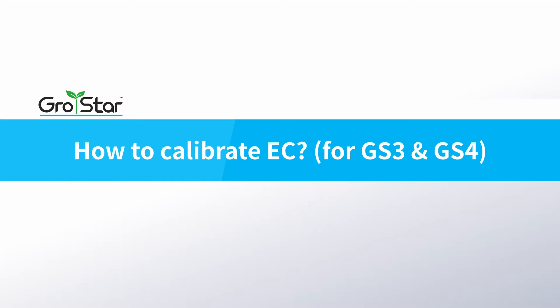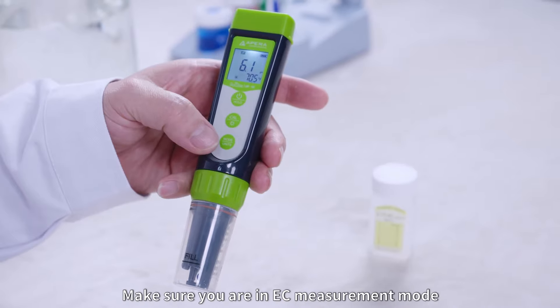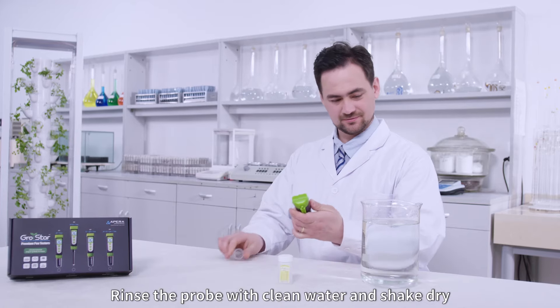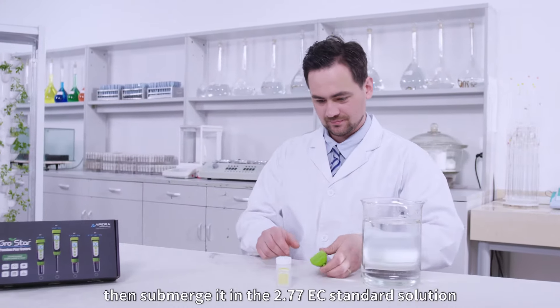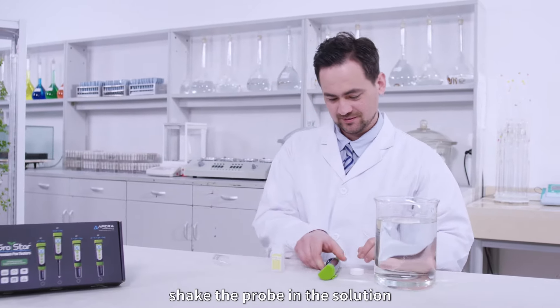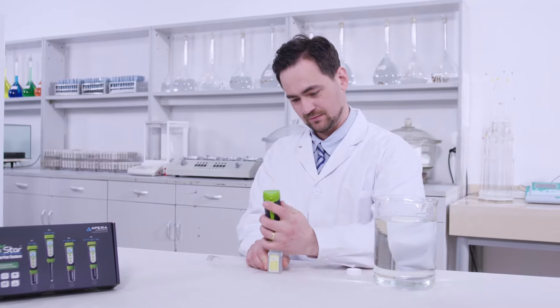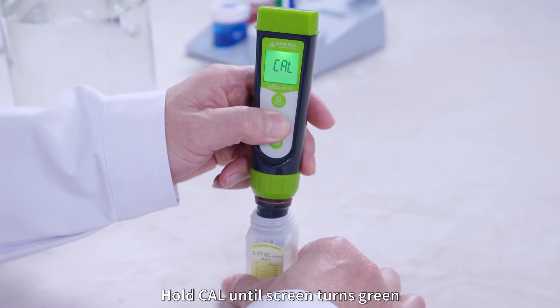How to calibrate EC. Power on and remove the probe cap. Make sure that you are in EC measurement mode. Rinse the probe with clean water and shake dry, then submerge it in the 2.77 EC standard solution. Shake the probe vertically in the solution for a few seconds and let it stand.